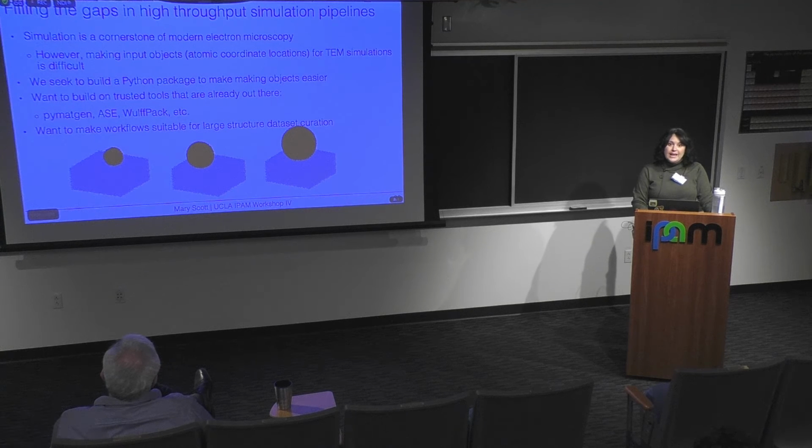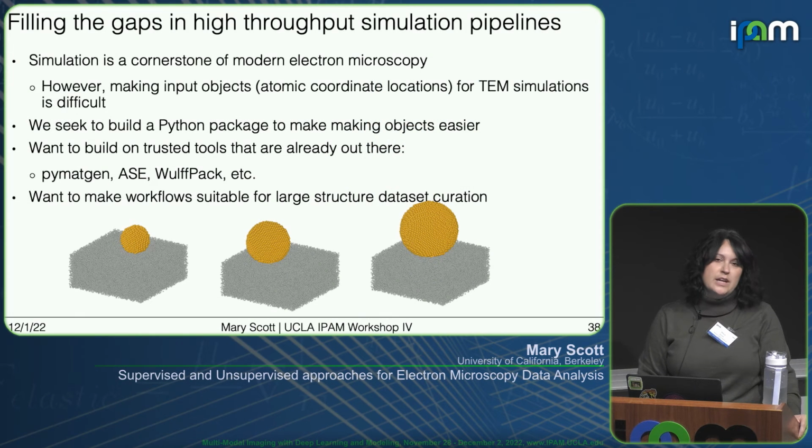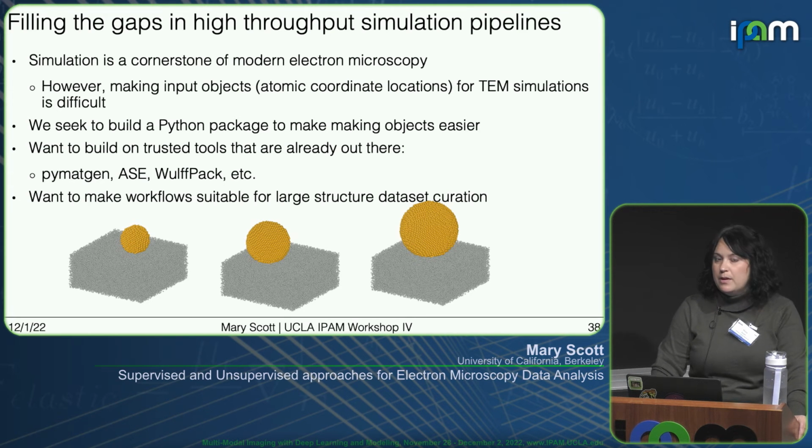You know, there is a long legacy in our field, definitely before my time, of folks developing physically realistic image simulation that takes into account the physics of the interaction between the electron and the sample in a realistic way. So that existed before I touched an electron microscope. What has changed, I would say, during my career is these simulations have become much faster. We have better computational resources. We're able to implement these now, maybe on your desktop or kind of a beefy workstation in minutes rather than days. One of the bottlenecks, however, is actually making those input objects.